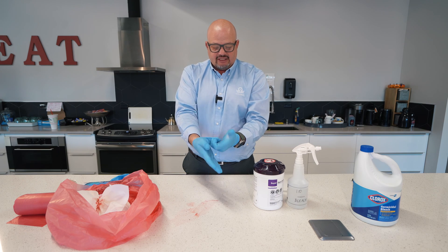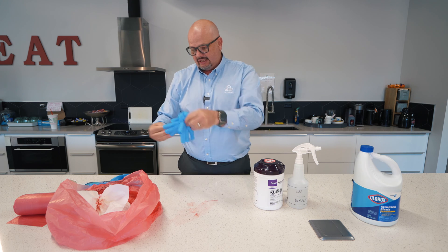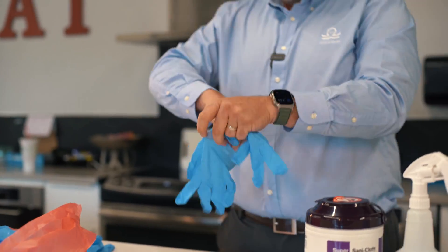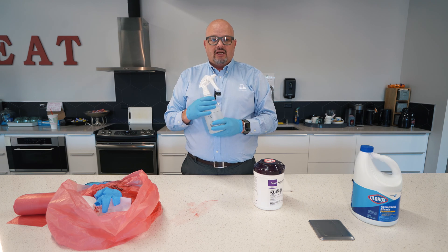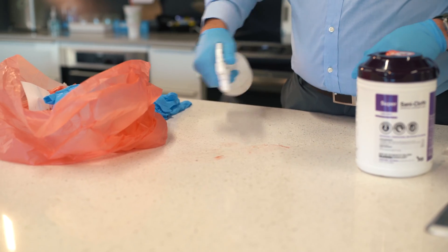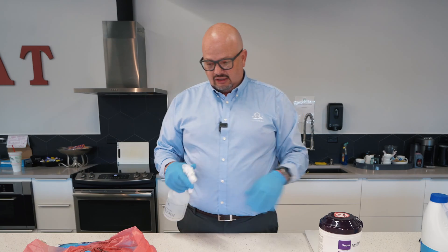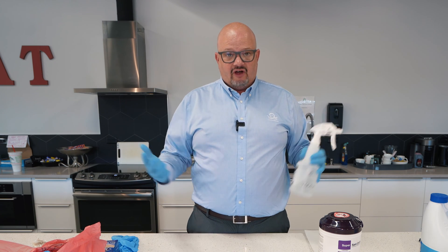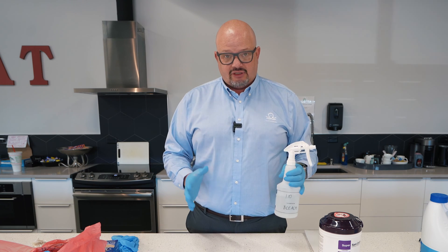I'm removing the gloves from the inside out and placing them in my bag. I'll grab another set of gloves. Now — remember the three-minute dwell time — I'm going to spray the surface. This step makes it safe to touch whatever is contaminated. Treat everything as contaminated: if you walk in and don't know what the spill is — vomit, feces, whatever — treat it like a blood-borne pathogen spill.